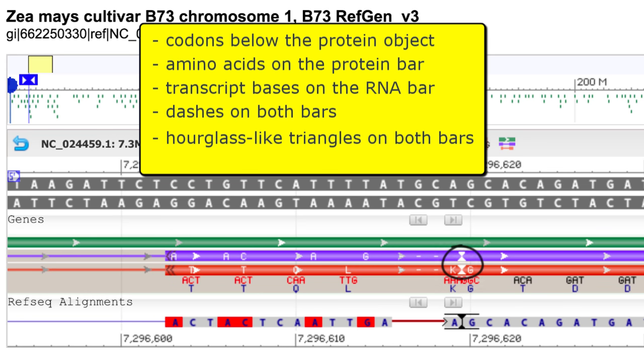And hourglass-like triangles in the RNA and protein bars represent insertions relative to the genomic sequence.